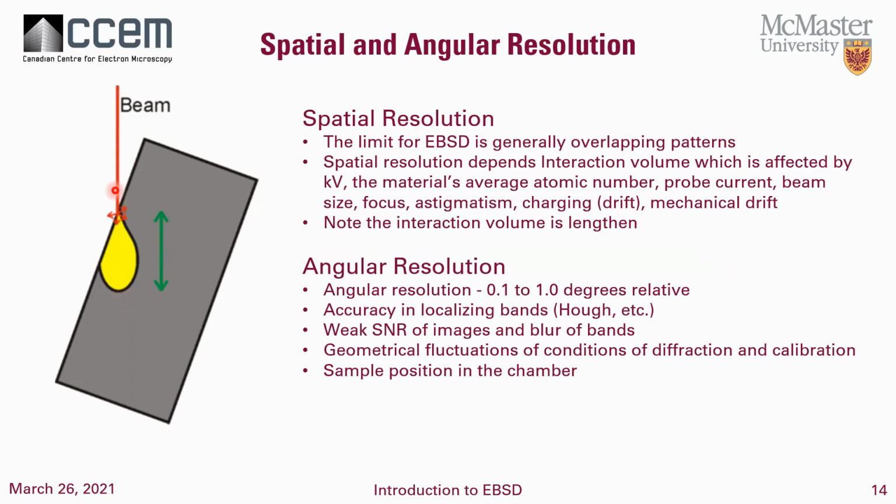And you'll notice here that in the y direction, the interaction volume is lengthened because we're doing 70 degrees of tilt. Now, for angular resolution, the absolute value is probably around 0.5 to 2 degrees.